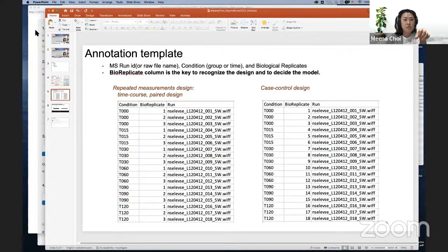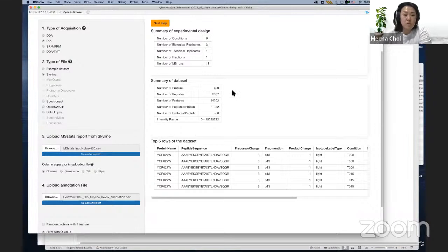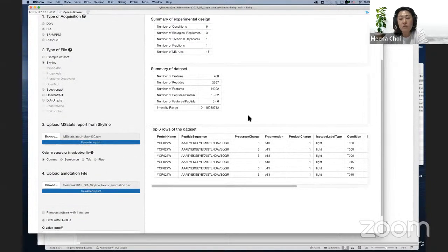So I think everyone can load the 400 data set, I guess. We are going to use the Shiny application. If time allows, I will show you the R Studio command line based R code, but all the command line scripts are already available in the Google Drive.